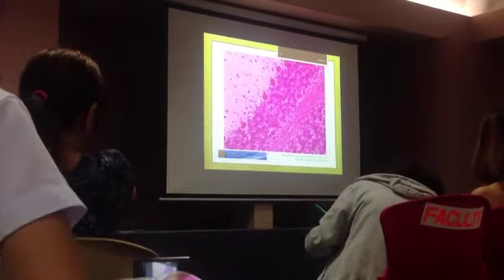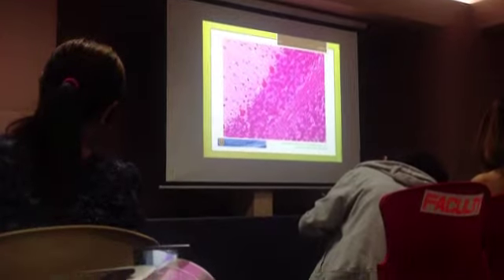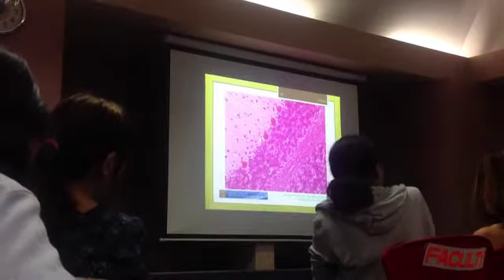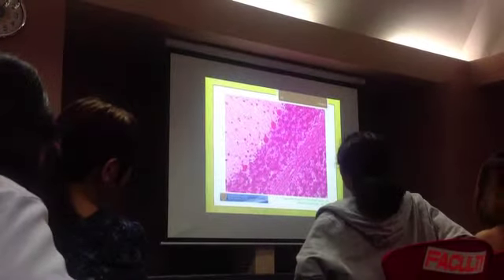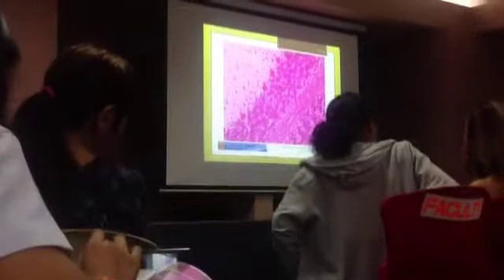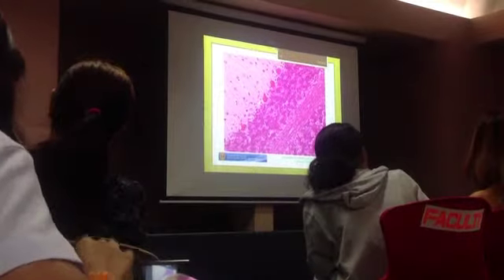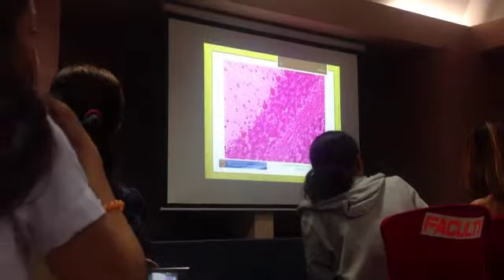According to size, classify it according to size. Dr. Tan is asking, classify it according to size. Who would like to answer? Miss Noor. Golgi type 1. Okay, correct.